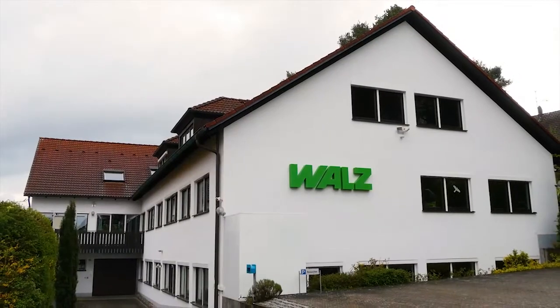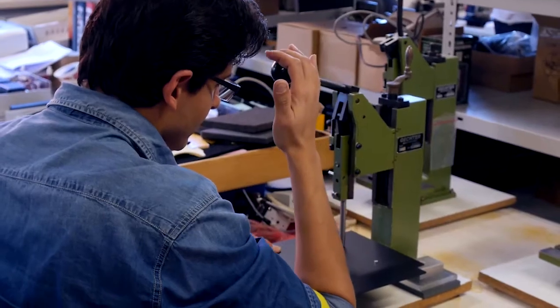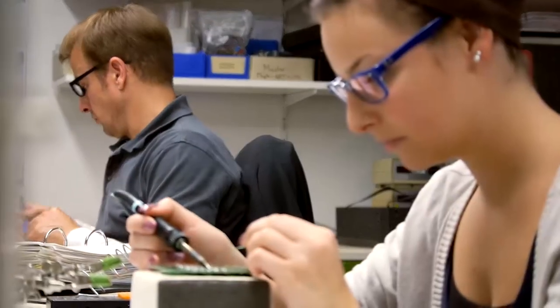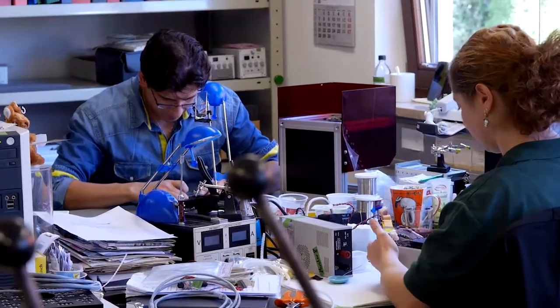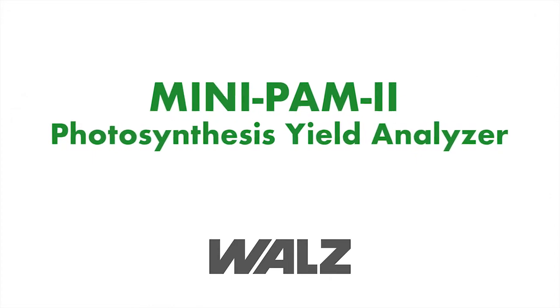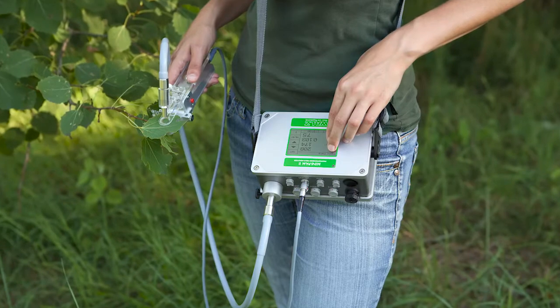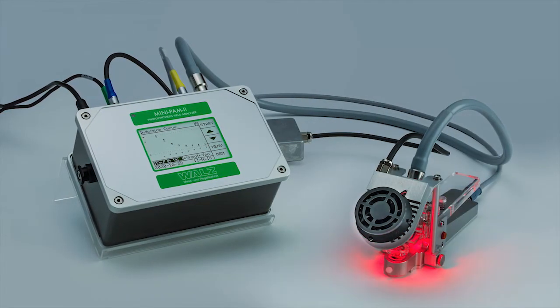For almost 50 years, Waltz has been providing top-quality chlorophyll fluorometers to measure photosynthetic efficiency. These devices are called PAM fluorometers because they apply the principle of pulse amplitude modulation. This video highlights the MINI-PAM2 device, a fluorometer especially designed for field operation but equally well suited for studies in controlled laboratory settings.